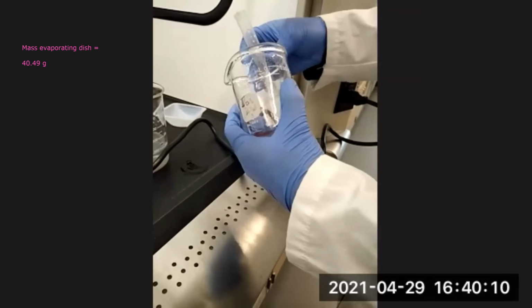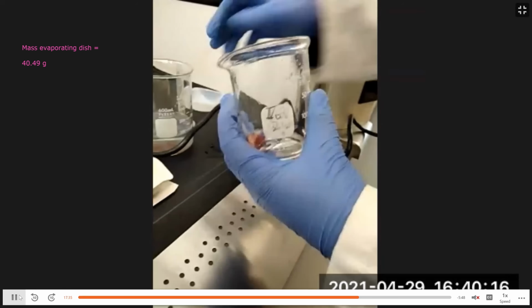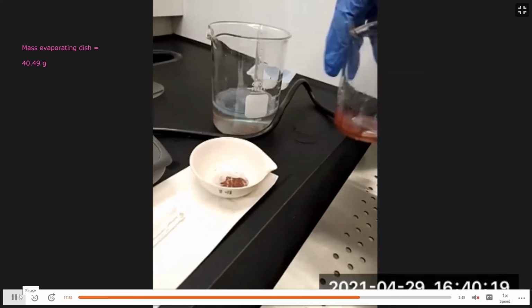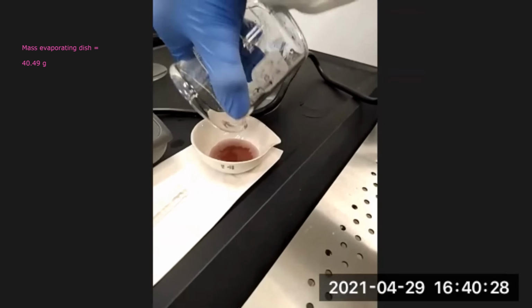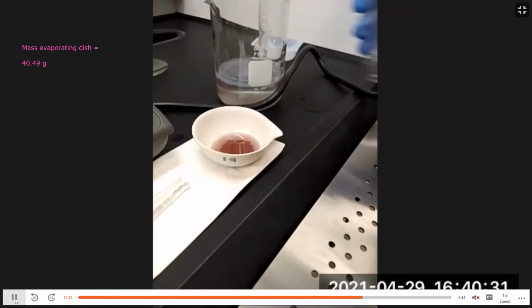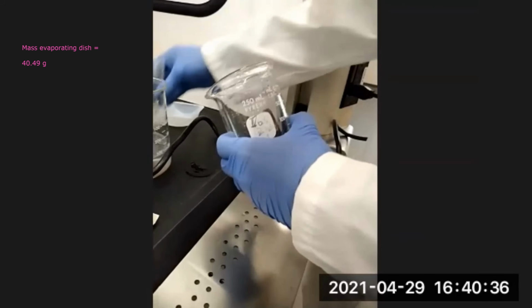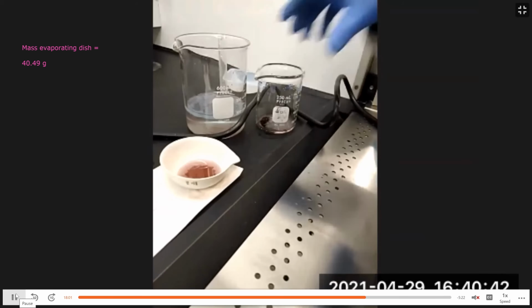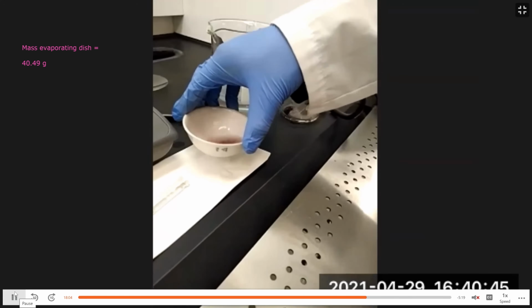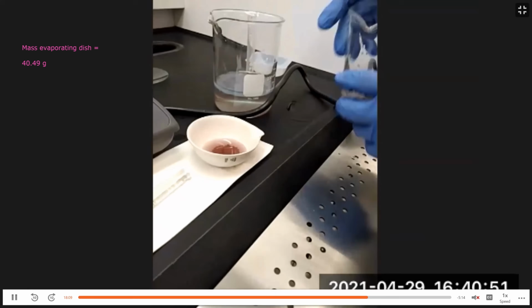Now we're adding some of the methanol or acetone we're using to wash the copper. We're going to swirl it around and then pour it into the evaporating dish to get the rest of the copper out. That's a good way when you're washing: just add the solvent you're using for washing into the beaker, swirl it around, and then pour it into the evaporating dish so that it washes the copper as well. Very important that you wash your product because we don't want dirty product.